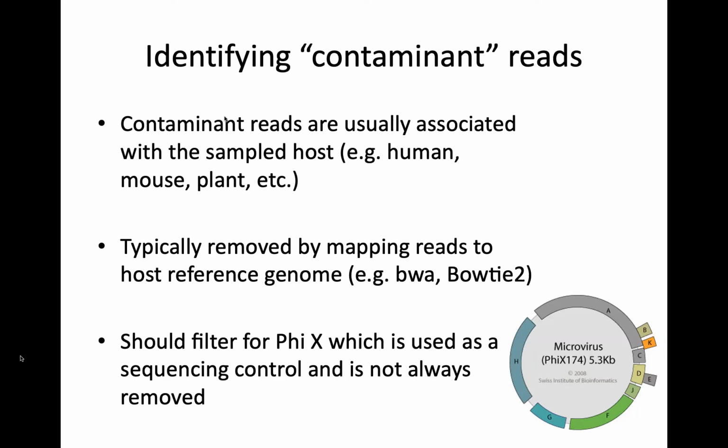Yes. That sounds like a good plan to treat those as something that should be a bit more secure. And I think what I have seen, this comes into play probably the most: number one thing is usually with most microbiome experiments, you're going to upload your data to the SRA or the ENA, right? To a public repository in many circumstances. And so if you're doing that, probably a good idea that the reads that you upload aren't just the raw reads. Maybe you're going to take this step here where you've removed the human reads and upload the microbial reads, unless you have proper REB to upload the human reads as well.